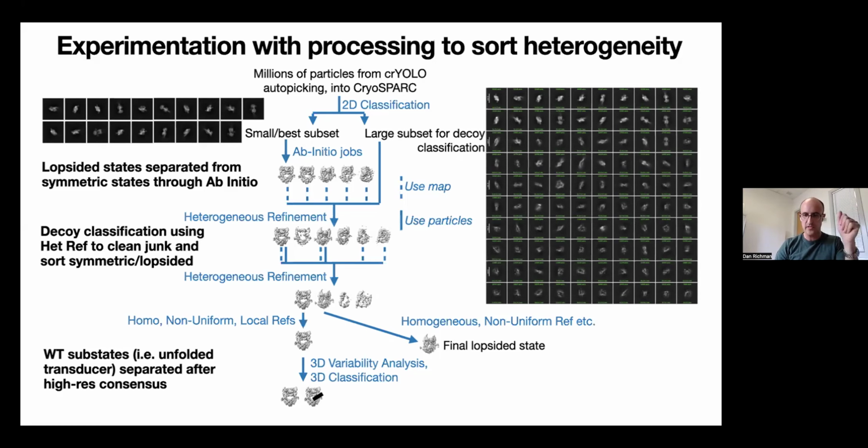The workflow is similar for the cleavage state, but that actually popped out much easier. Fewer rounds of heterogeneous refinement, less orientation bias. So that was an interesting, subtle difference in the protein causing a dramatic difference in the quality of the cryo-EM results.